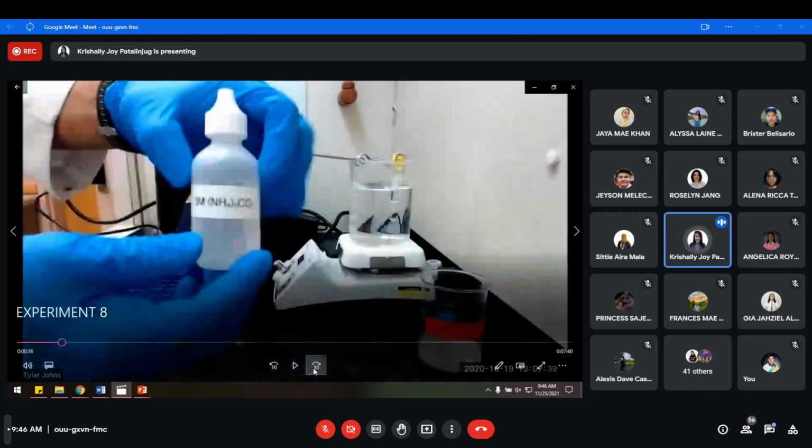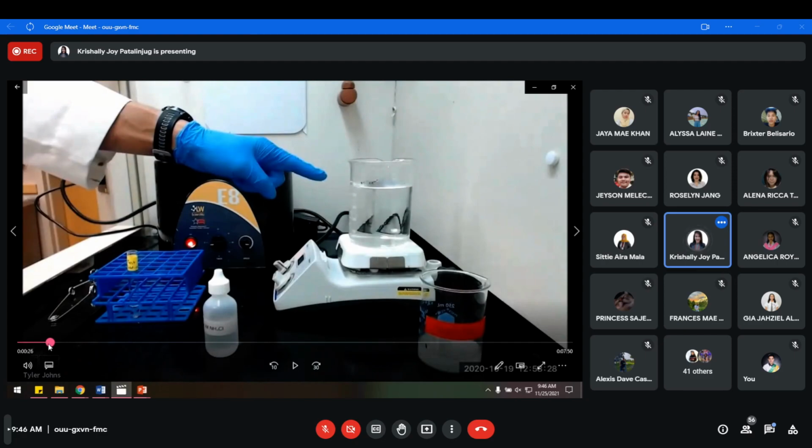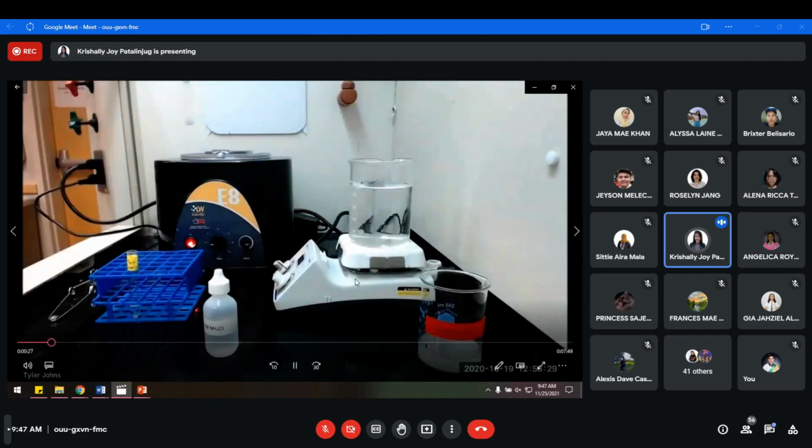Okay? So how does the activity start? He added ammonium chloride. The ammonium chloride is being added, then it is being heated in a water bath, and then the ammonium carbonate is added. Ammonium carbonate is the main precipitating agent.